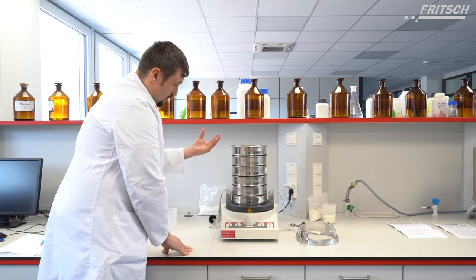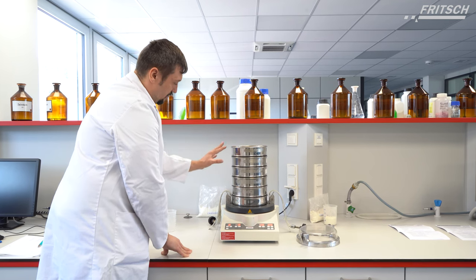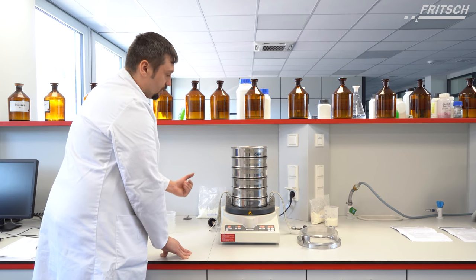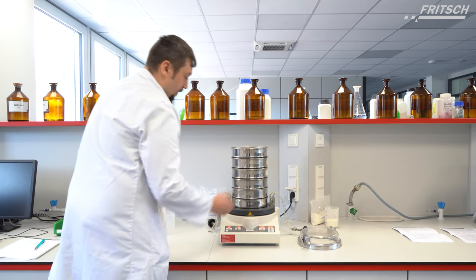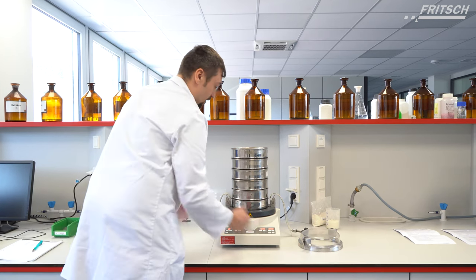All sieves have, as mentioned, five 5-millimeter gate balls as sieving aids to avoid electrostatic loading. Now we can put the lid on the whole sieve stack and fix it.